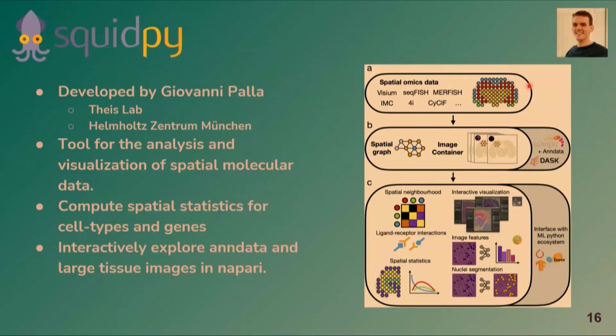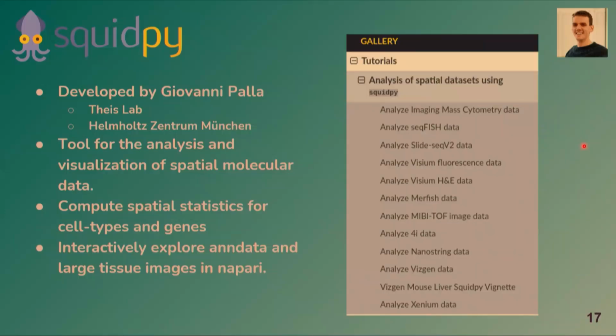And it is not only for visualization, but also for computing spatial statistics. Because when you aggregate spatial information, we have to do a more specific and customized statistical analysis, because spatial data has its own particularities. So Squidpy has support for a wide range of spatial transcriptomics technologies.